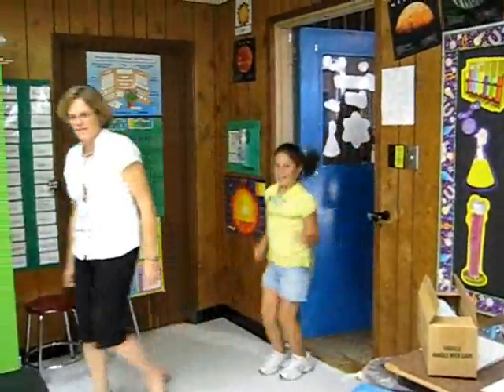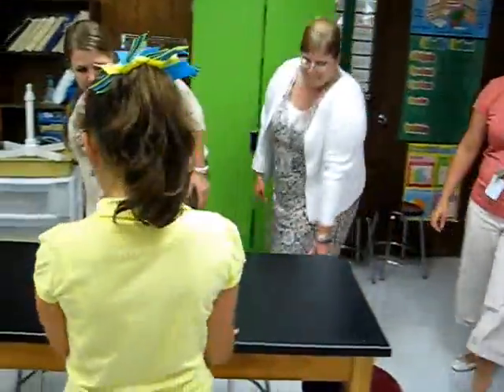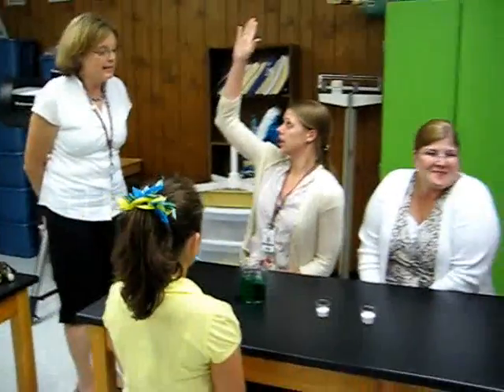Come on in boys and girls, find a seat. All right, remember that we don't touch anything on the table. Yes ma'am. Before we start, thank you. All right, yes ma'am.